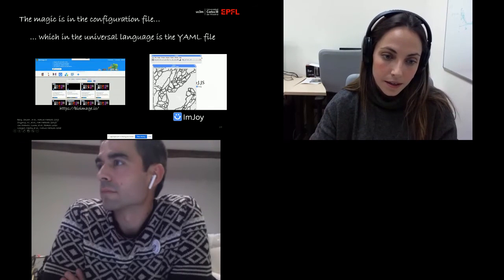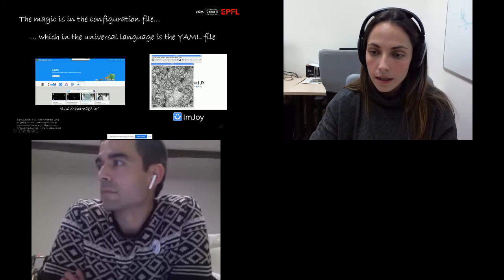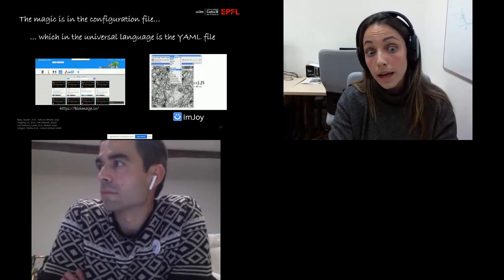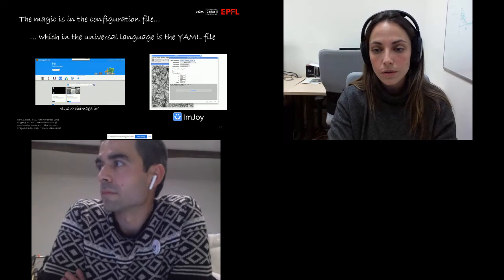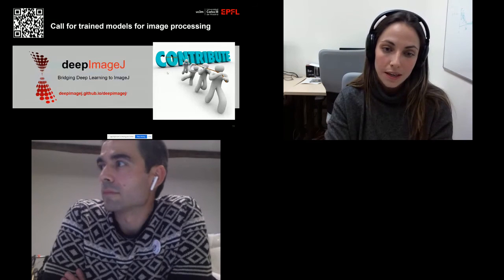Also, the idea for this web page is that there's going to be a runner. Here is the runner for DeepImageJ, so you can try your models online to decide whether you want to download or not, or use it or not.